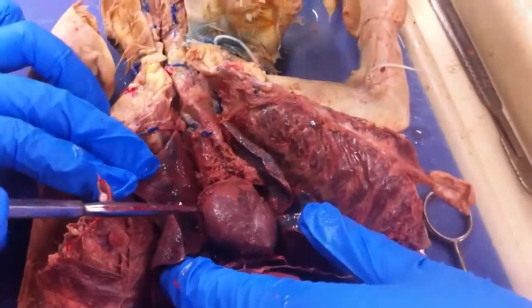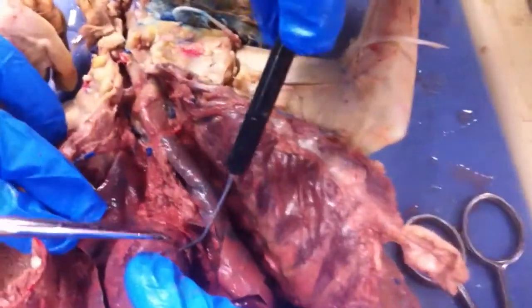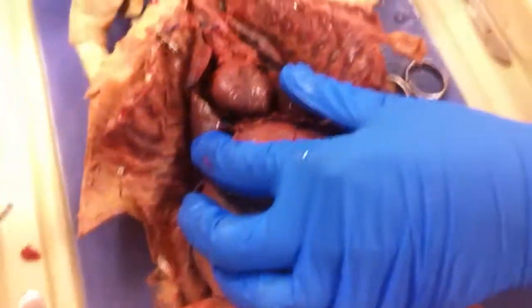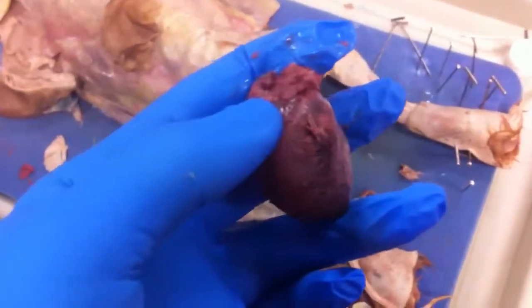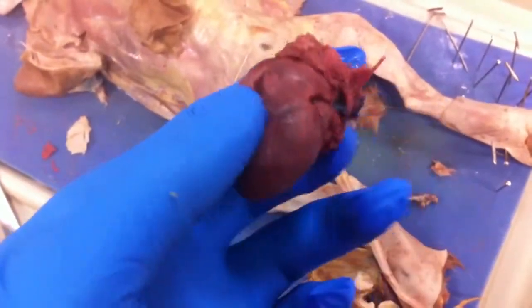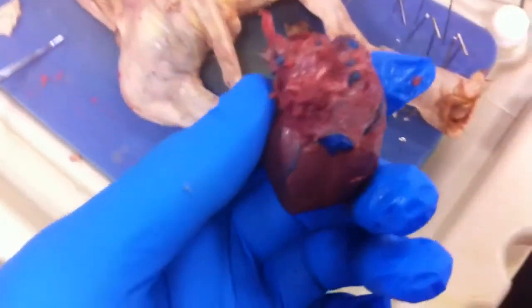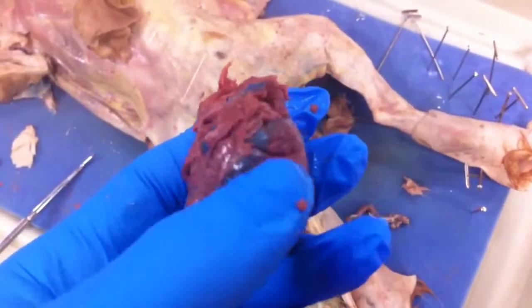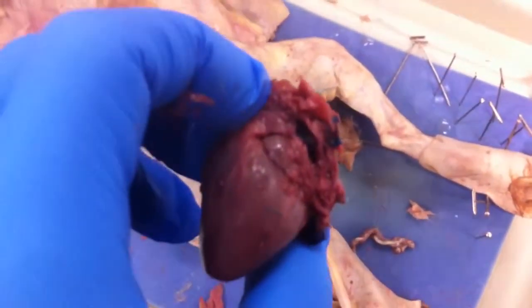And this right here is the heart. And you can see on each side they have a left and right auricle. They're the elephant-shaped ears right here on both sides. Alright, the heart removed. This large portion here is the base. This right here, where my thumb is, is the right auricle of the right atrium. Now you can see the artery that was still connected to this. This is the aorta. And the left auricle of the left atrium is beneath this patch of skin here. You can see it right there.